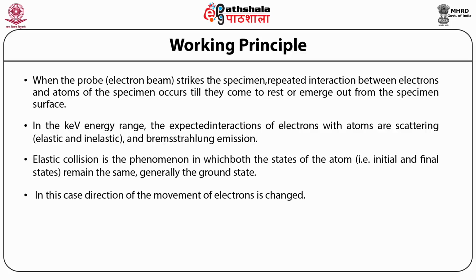Elastic collision is the phenomenon in which both the states of the atom, that is, initial and final states, remain the same, which is generally the ground state.